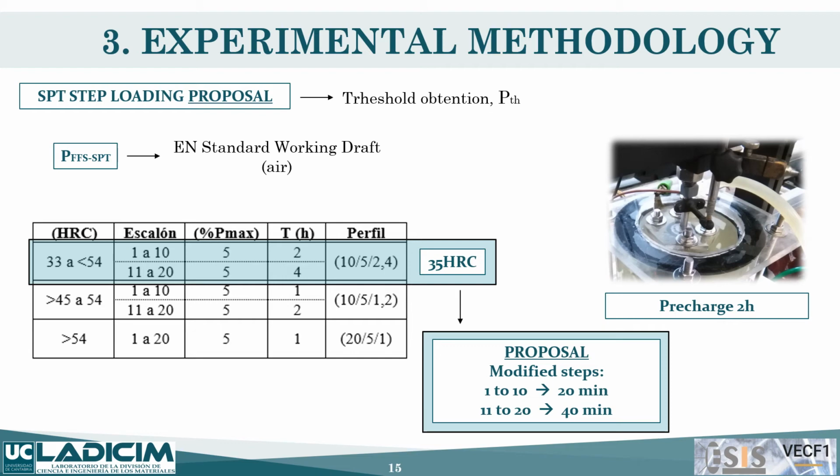First of all, we obtain the fast fracture load by performing a small punch test in air at regular rates following the recommendation of the European Standard Draft. Then, for our 35 Rockwell C material, we need to do 20 steps of 5% of this value each with a certain duration.